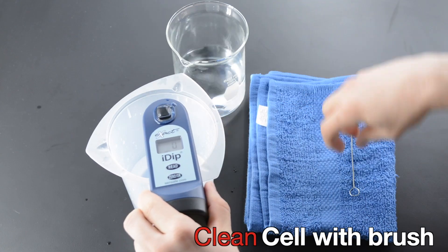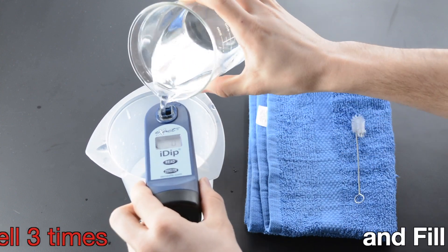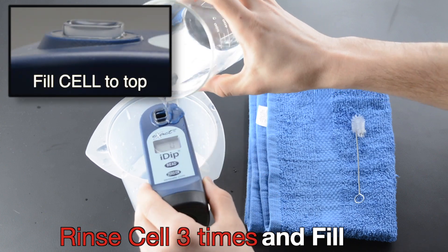Clean cell with brush. Rinse cell three times and fill. Fill cell to top.